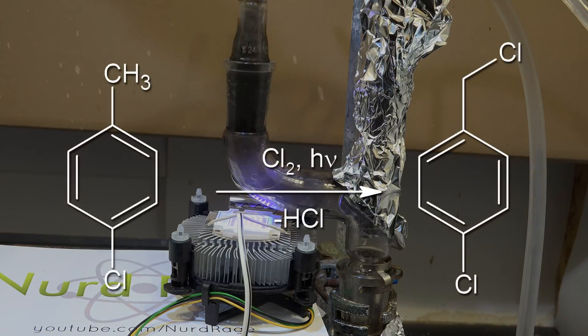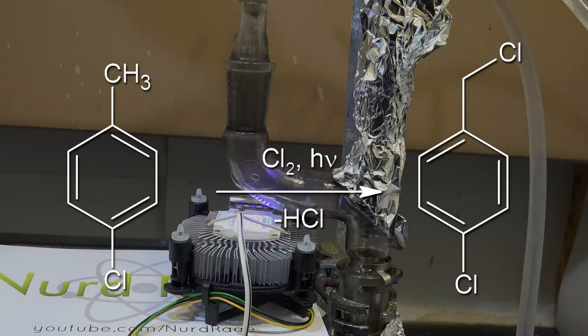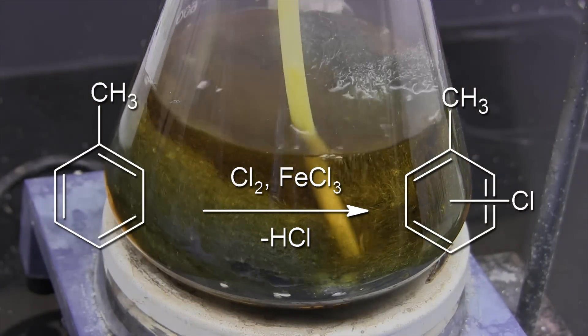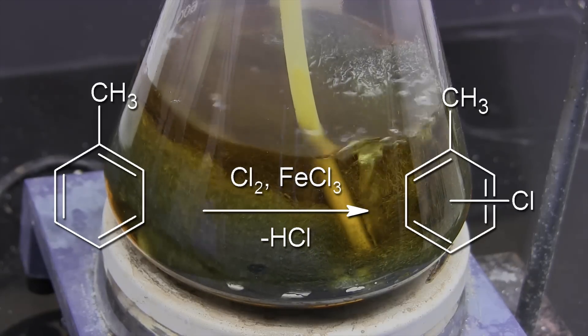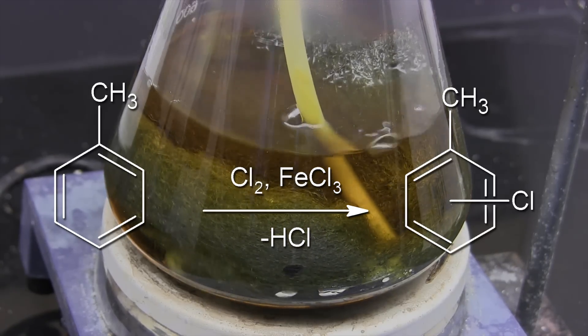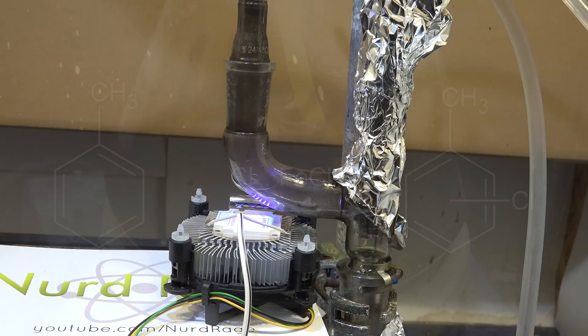What's interesting about this reaction is that it only chlorinates the methyl group, not the ring. In contrast when we were making chlorotoluene we also used chlorine gas but by using an iron chloride catalyst rather than UV light we chlorinated just the ring. This demonstrates the importance of selecting the right reaction conditions to influence the mechanism you want.